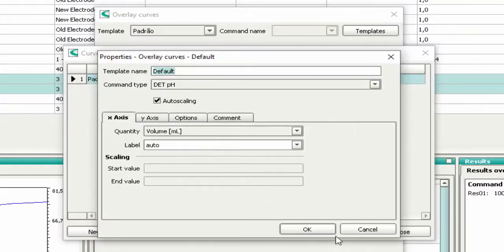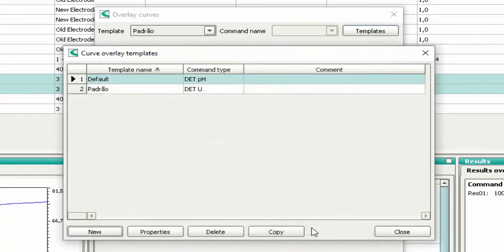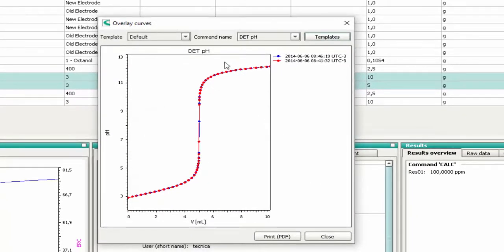Now press OK. Close the window. You'll see the overlaid titration curves.